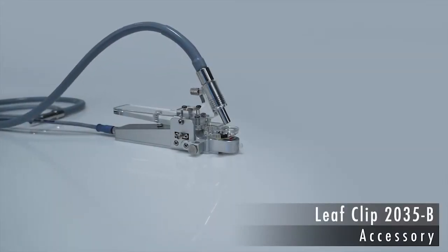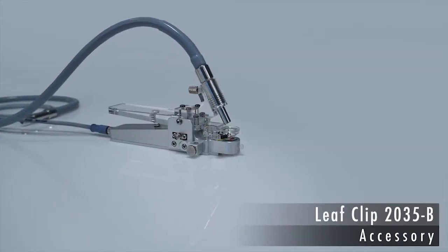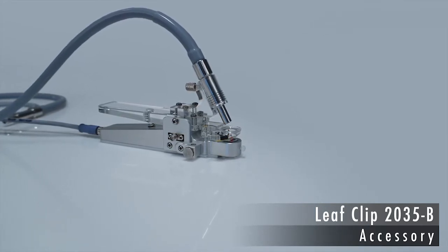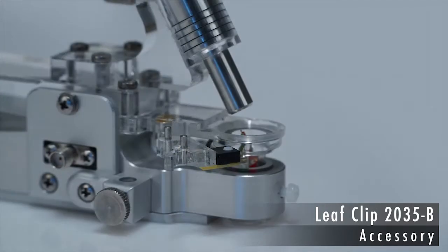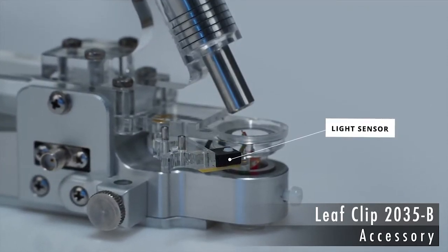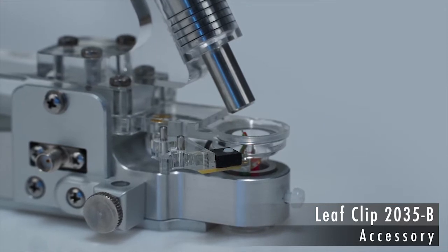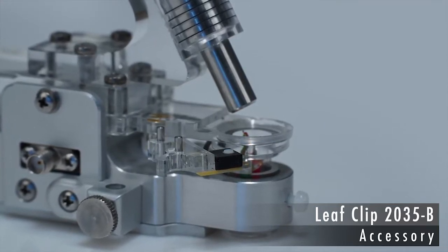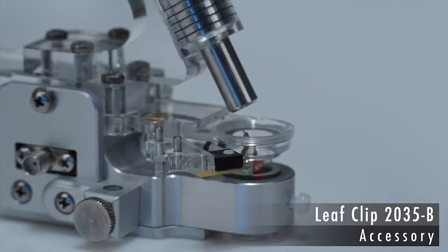The 2035B field clip is designed to measure the performance of Photosystem II when the leaf is exposed to light. The field clip is equipped with a precise PAR sensor. The photosynthetic electron transport rate can then be derived from both the PAR and Photosystem II performance.